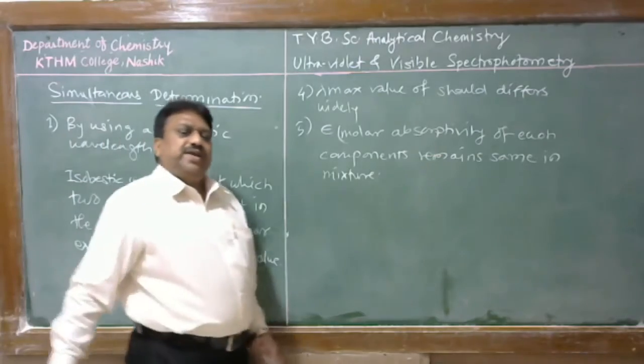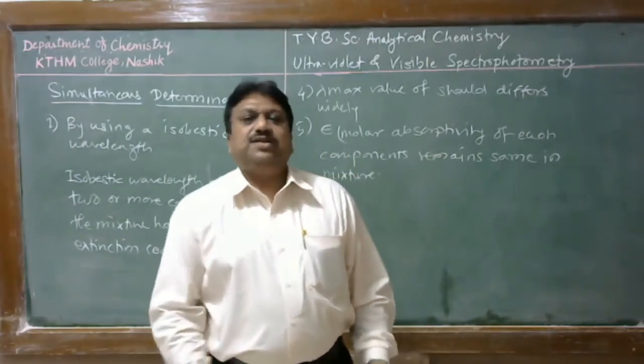Then we can determine two or more components simultaneously.